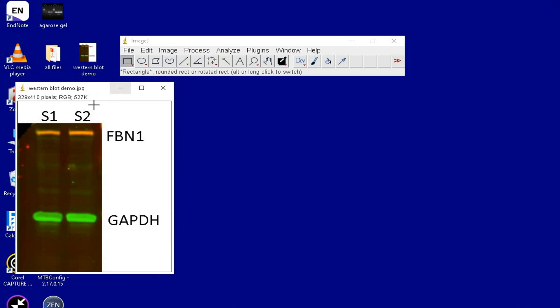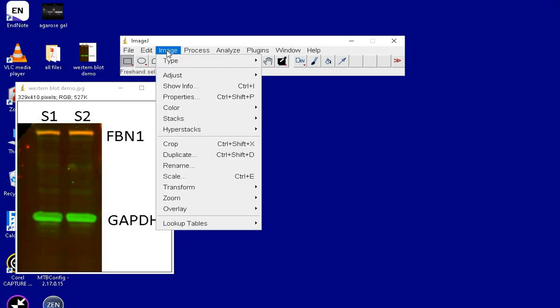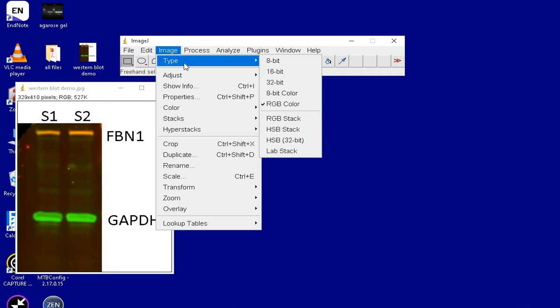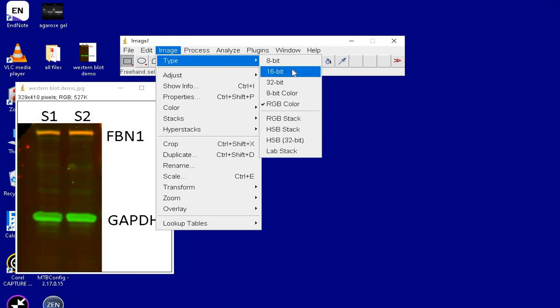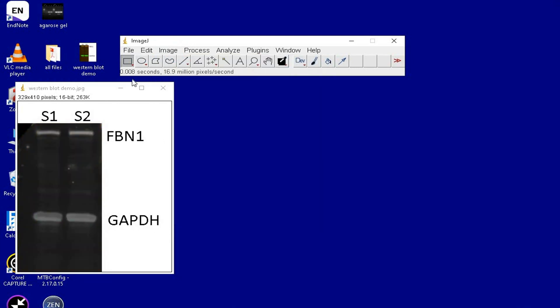On the lower side of the blot in green, the bands are of a housekeeping gene, GAPDH. To perform a densitometric analysis of the bands of our interest, the image has to be converted into an 8-bit or a 16-bit image.